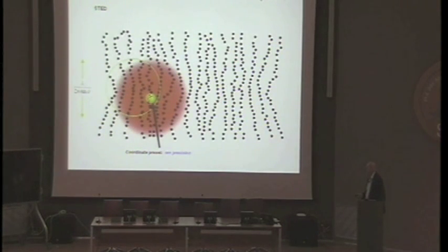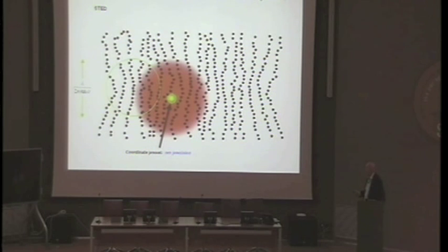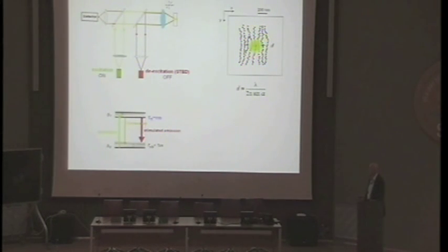Okay. In many cases, the recordings are still done with a single beam. If you look at scattering tissue, in the neurosciences very often you have that, then it is still advantageous, or in most cases advantageous, to use a single beam. Anyway, some of you will have wondered how we make that ring-shaped beam. I'm not going to bother you with technical details, but it's not very difficult. One uses a piece of glass that has a difference in thickness, and the difference in thickness imprints a phase change from 0 to 2 pi.